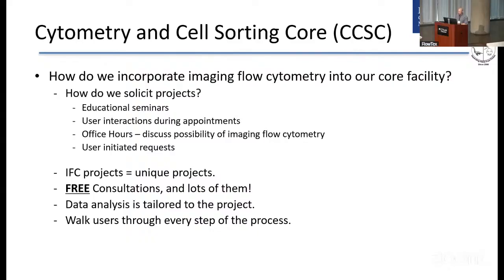However, it's important to communicate that there's a broad range of discovery that can happen with some relatively simple experiments. This is useful as a way to overcome that initial hesitancy to IFC. And as you can see in the projects I'll describe, the majority of the experimental setup is actually fairly straightforward. And even with that, we're able to extract a lot of information from fairly simple experiments. Generally, we have a lot of consultations with users thinking about imaging flow cytometry. These can happen before you start your project, during the project, when the wet lab experiments are happening, and post-acquisition and during data analysis.